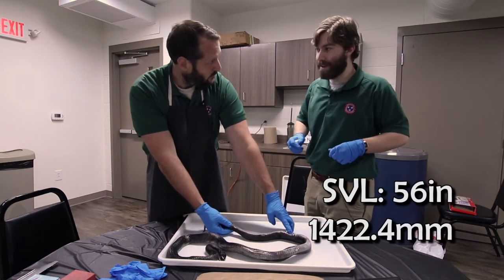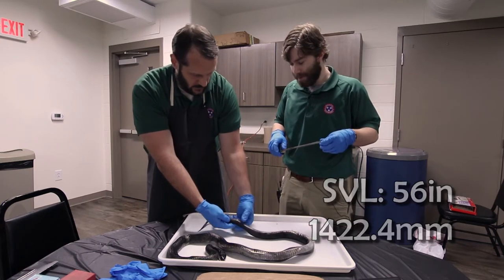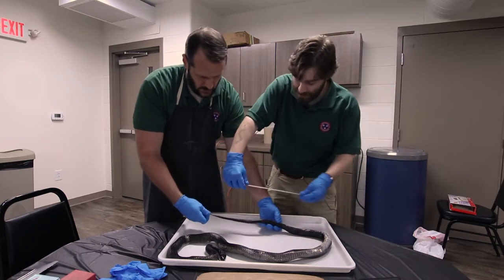We can convert that to centimeters or millimeters later on. Do we also do total length? Yep, we can just measure the tail to get the rest of the length. Okay.